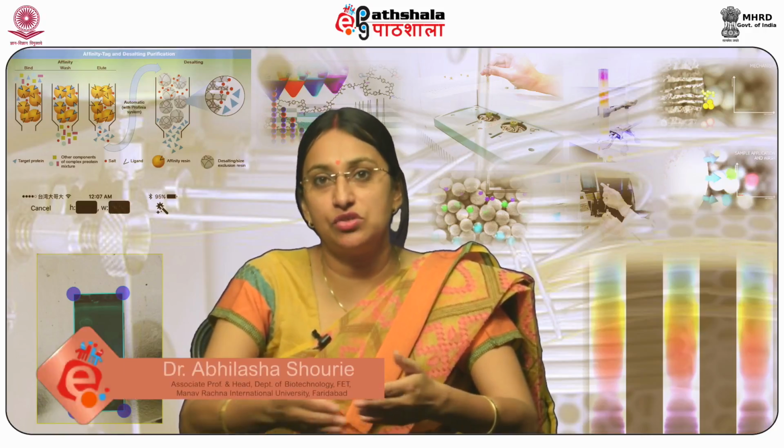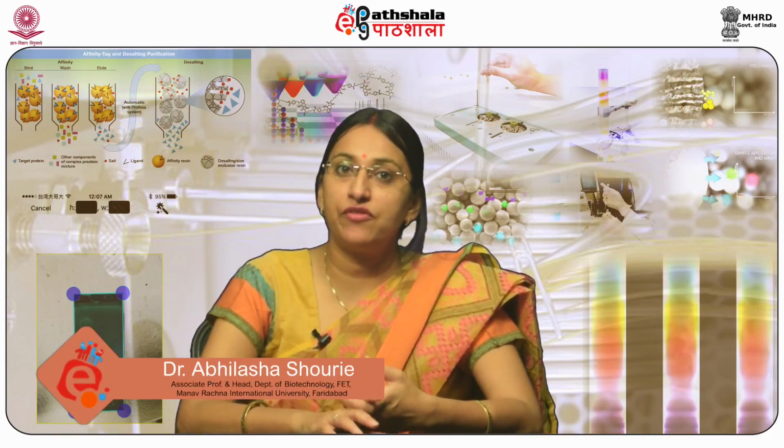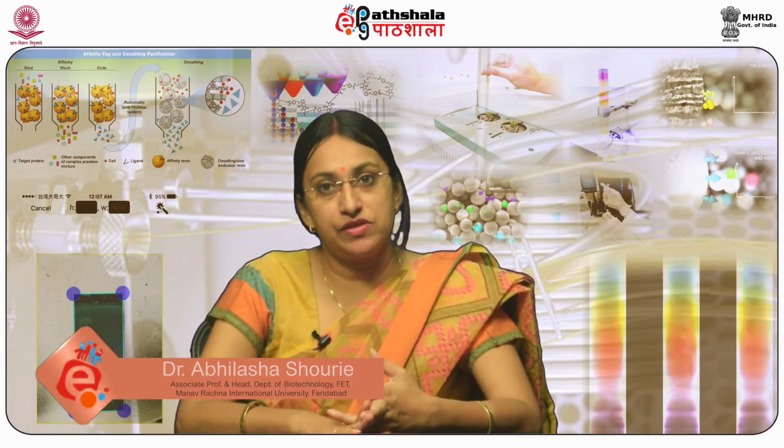So students, now let us summarize what we have learnt in this module. The composition of mobile phase to be used is selected on the basis of nature of analytes. The flow rate of mobile phase is a critical factor affecting the efficiency of separation in HPLC. Mobile phase delivery system is used to continuously deliver the solvent into the column with smooth and constant flow rate. Efficiency of analysis and reproducibility of results is highly dependent on performance of the solvent delivery system in HPLC.